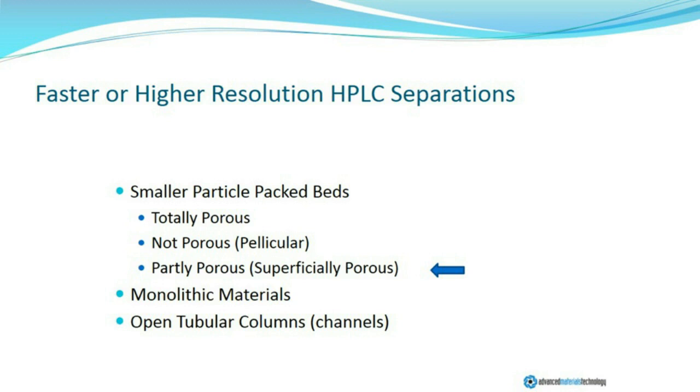These are, of course, the chip-type format that has been increasing in popularity in very recent years. None of these will really be discussed past the superficially porous materials. That's where today's examples, which are very much focused on what we can do in protein science.